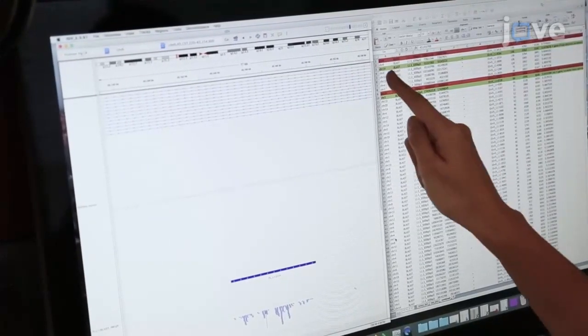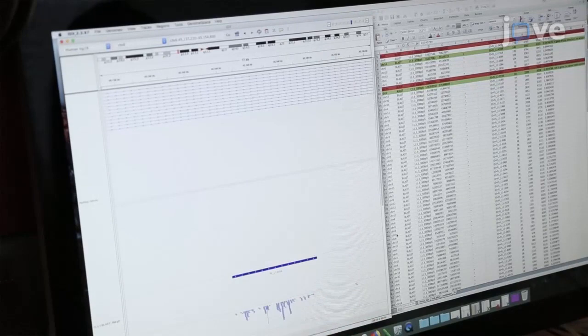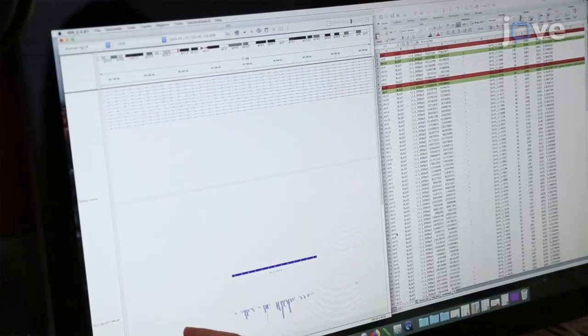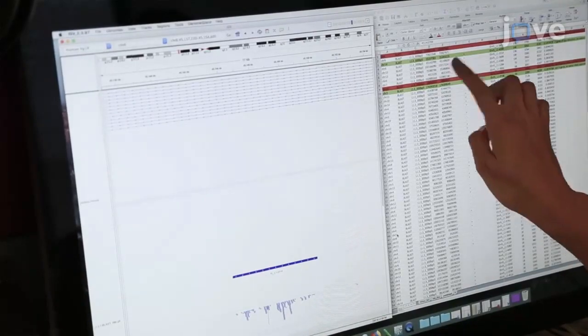In the sequencing library preparation, another step taken to reduce transcriptional noise unrelated to L1s includes the selection of polyadenylated transcripts. This removes L1-related transcript noise found in non-mRNA species.